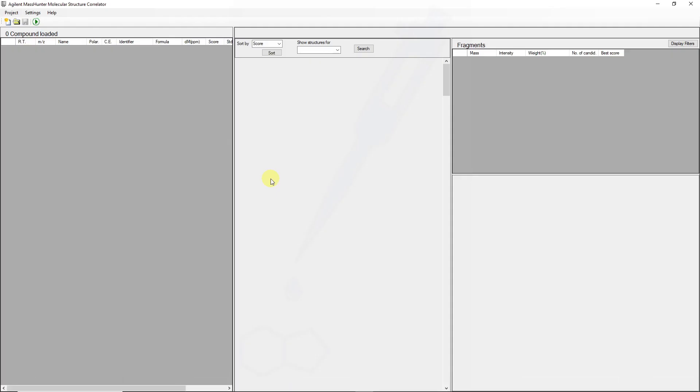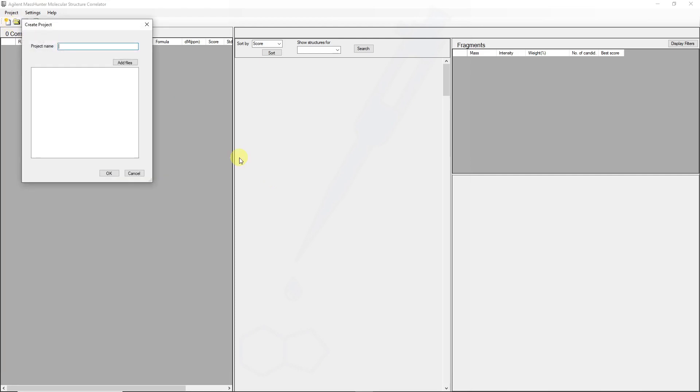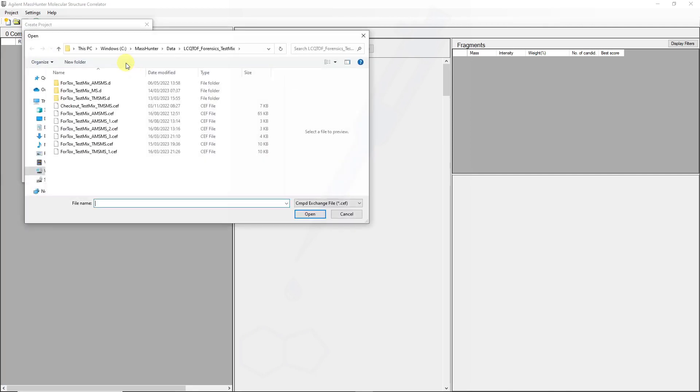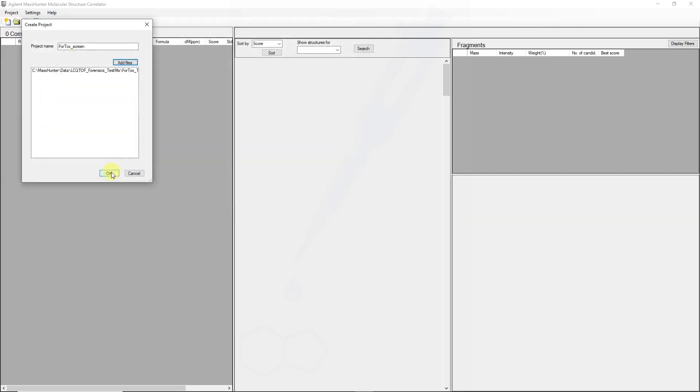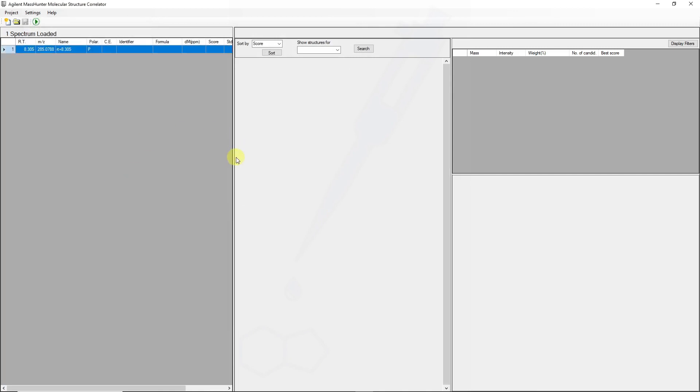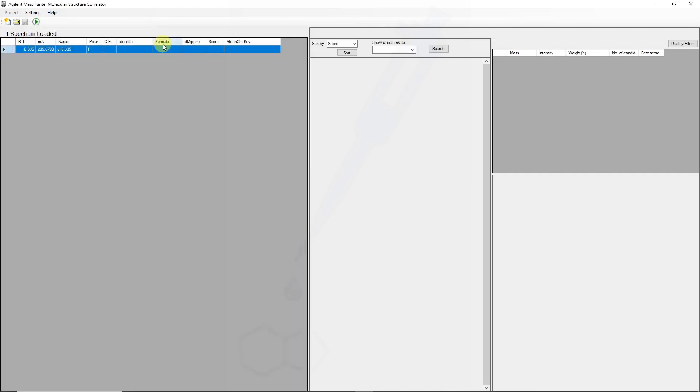We will now create a project in molecular structure correlator. We will now add that file. And once we've added a file, some of the information should be populated in a table. We can now select different methods for searching and different databases for searching. For now, I'm just going to screen my Forensics Toxicology PCDL, and then we can go to ChemSpider or other web-based searches.